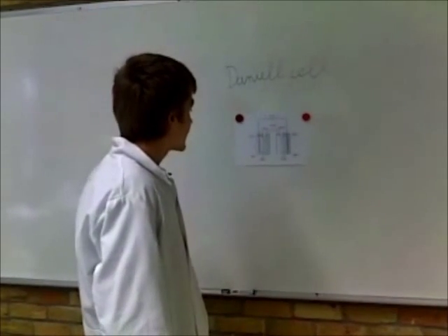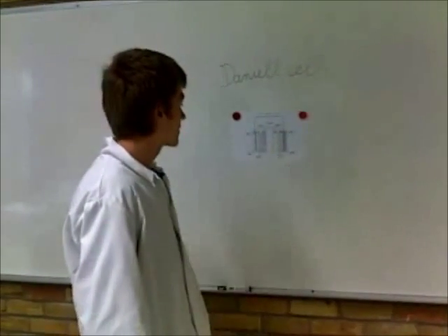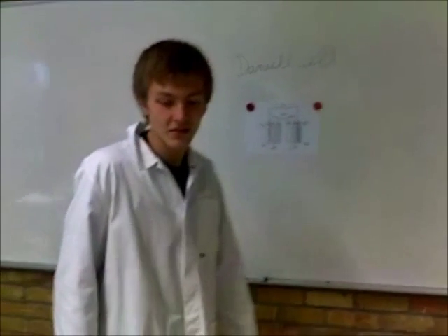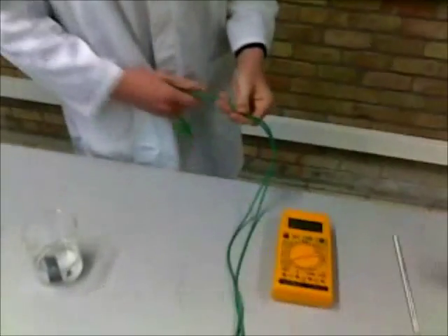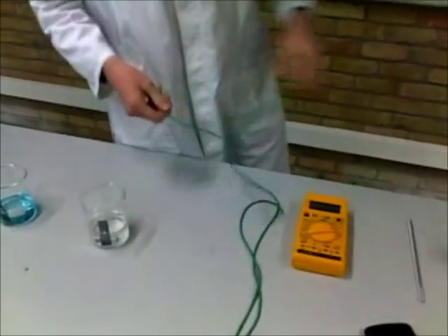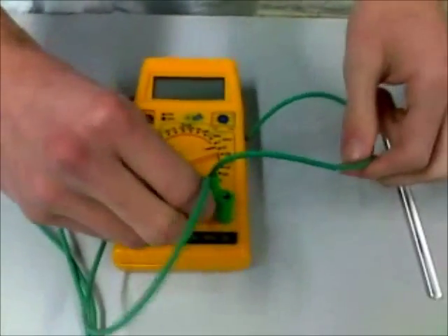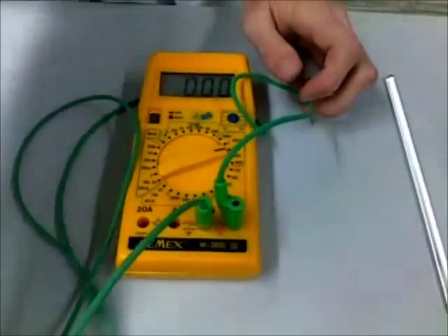Now we have to connect both the copper and zinc electrodes to the voltmeter to have a closed circuit. So we want to measure the voltage, so make sure to put it in this hole and this hole. Put it on. Use these crocodile teeth.